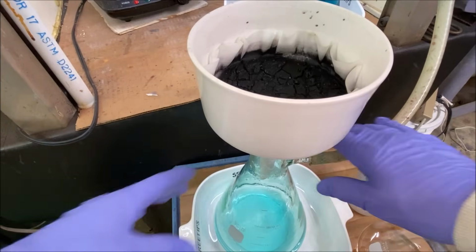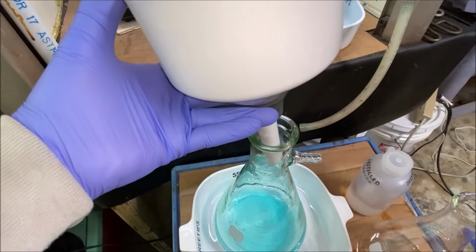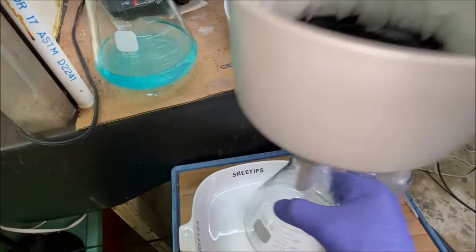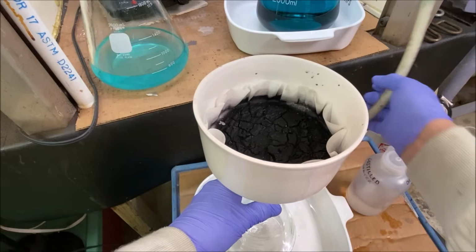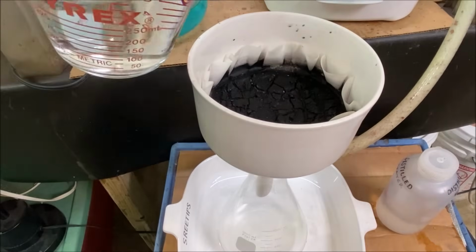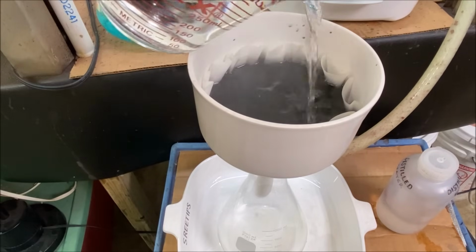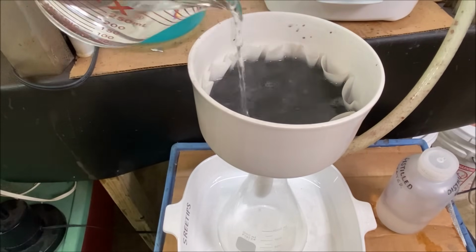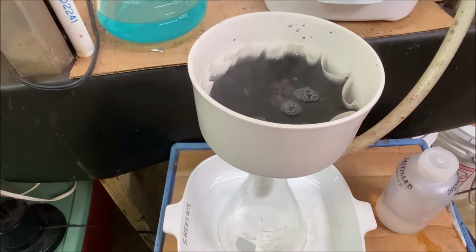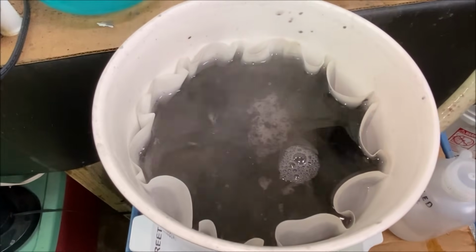I think I've got all the blue liquid rinsed off of these solids. Just to make sure, I'm going to put them on another flask, and have a look at the color of the rinse water. I'm adding some more hot distilled water. The goal of this is to see if we've got all of the blue liquid rinsed off of those solids. It's kind of got a purple color.